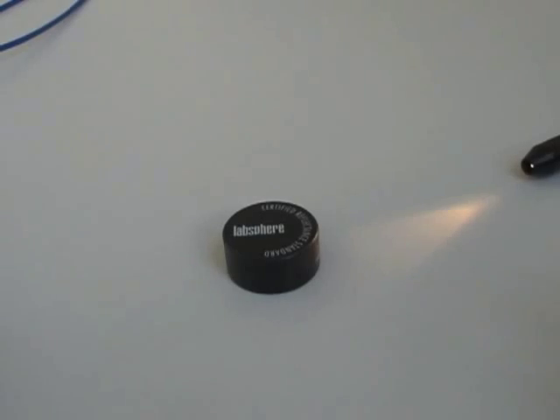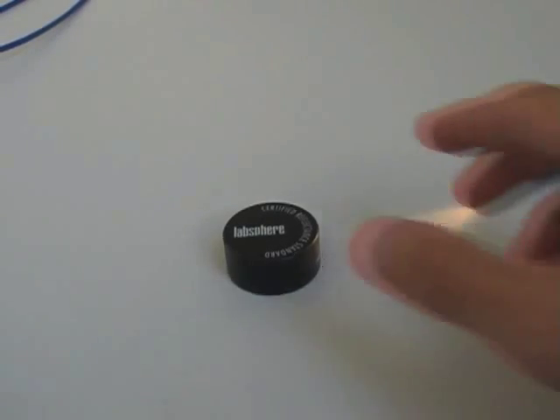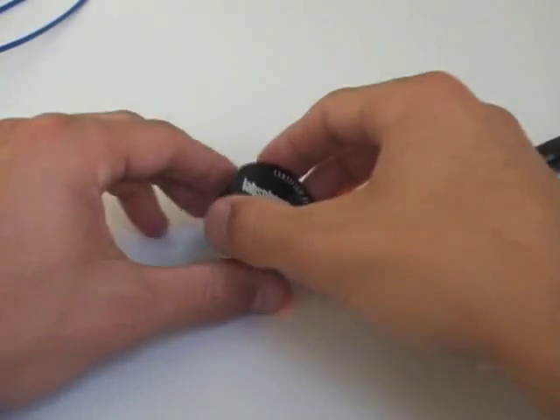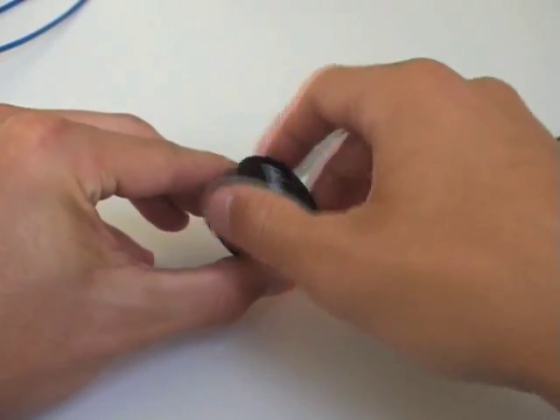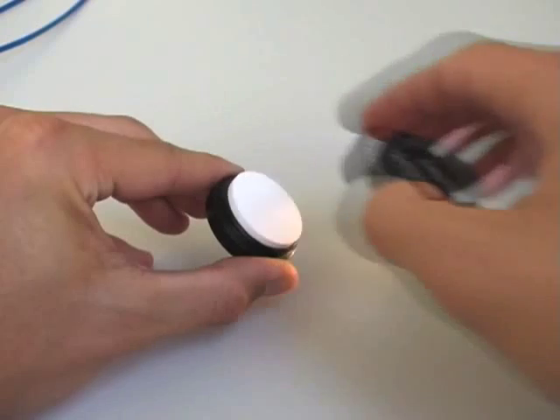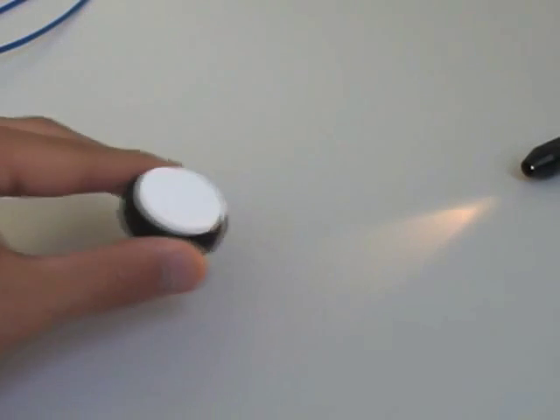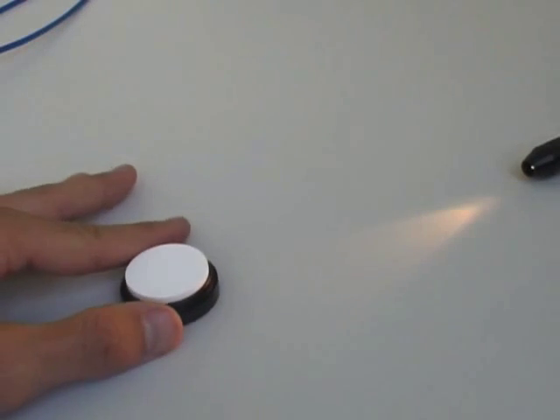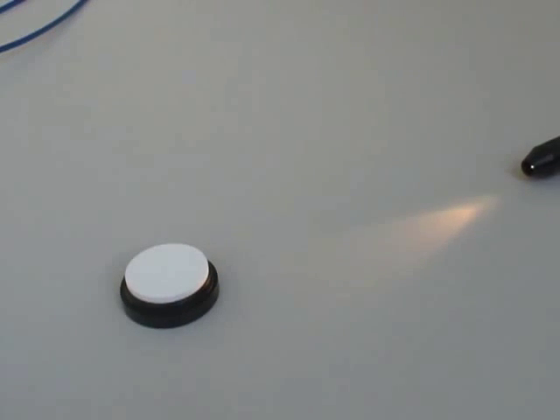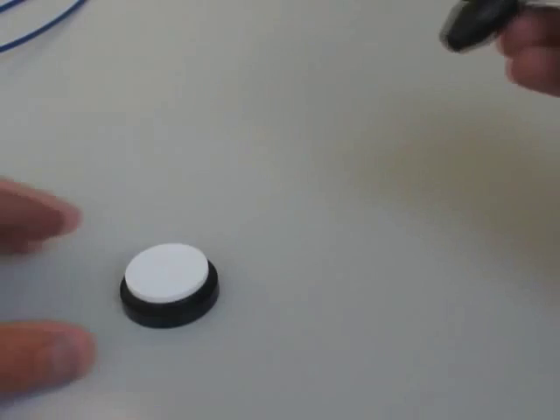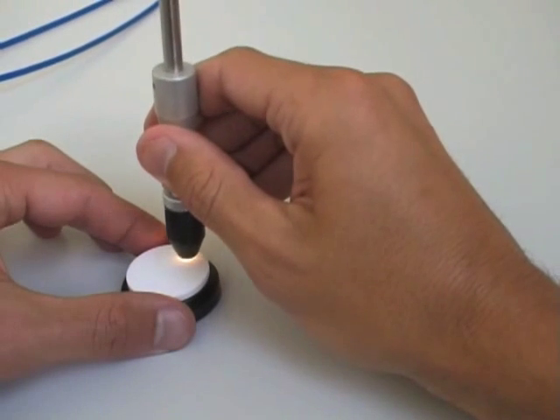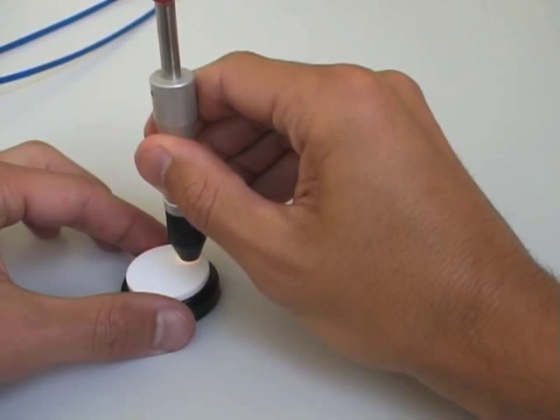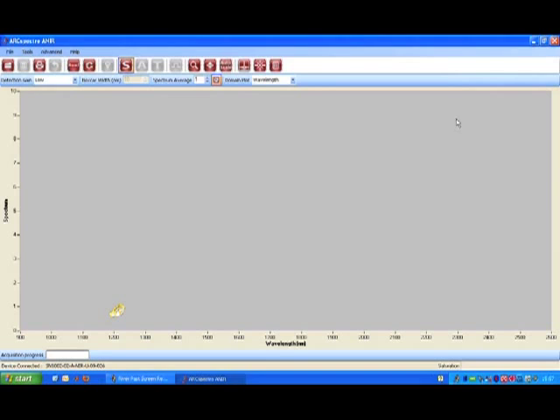To tune the sensitivity of your spectrometer, take the white reference standard, open it, take the fiber reflection probe and press it gently onto the reflection standard. Then press the read button in the software to start a measurement.